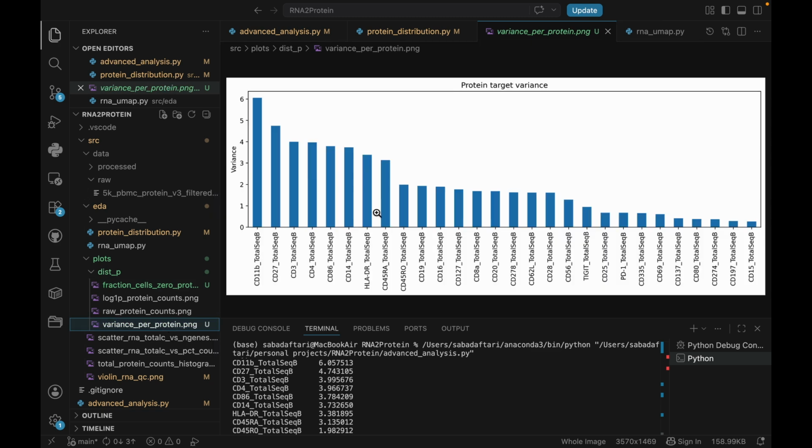So for the model, something like CD34 would be hard to predict because it's almost always 0. CD15 is hard to predict because it's almost always the same value. Both end up being poor prediction targets, but for completely different biological reasons. So at this point, because our dataset is not that huge, some people might want to keep everything and not remove any low variance proteins.